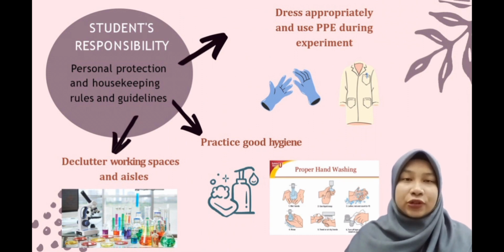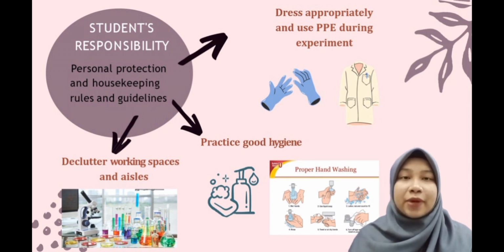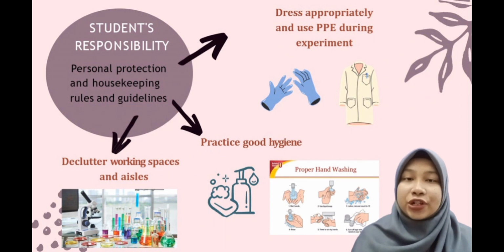Wash hands with soap and water after handling any hazardous materials to make sure that you don't carry any traces of chemicals with you. This is important if you plan to eat afterwards, to avoid transfer of chemicals to the food. For a more efficient workspace, ensure that no items block the paths and aisles, to reduce tripping hazards. It is crucial in case of an emergency when people need to evacuate fast.